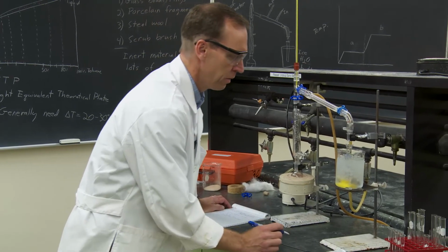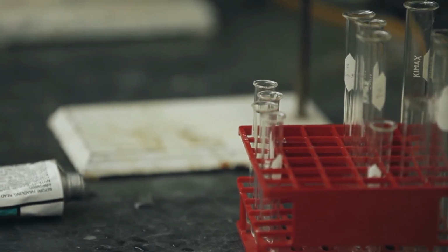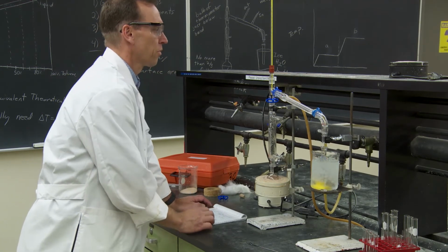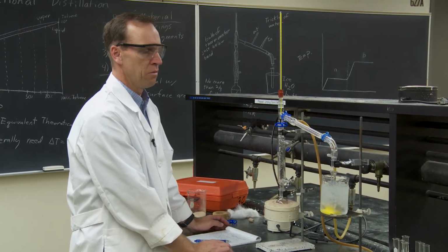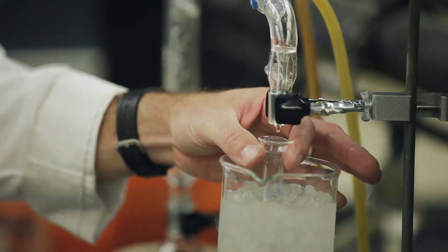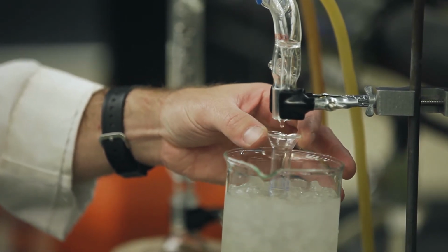Okay, and I've collected about the first few milliliters. Okay, and it'll just plateau at this temperature until all of the first component is distilled over. So the rate of your distillation, you want a drop every 1 to 2 seconds.